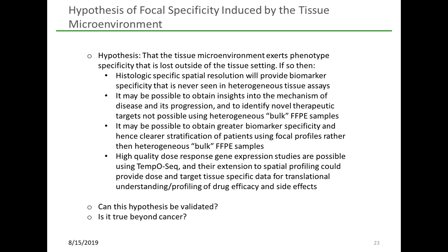But if so, then histologic-specific spatial resolution is going to provide a biomarker specificity that is never seen in heterogeneous tissue assays. And it may be possible then to obtain insights into the mechanism of disease and its progression, and to identify novel therapeutic targets, which are not possible to identify using heterogeneous bulk FFPE samples.